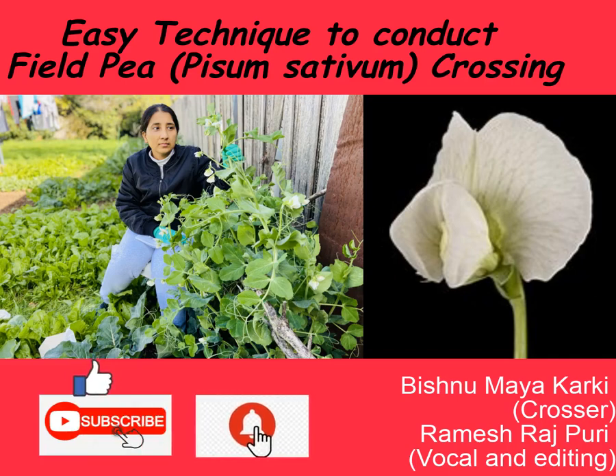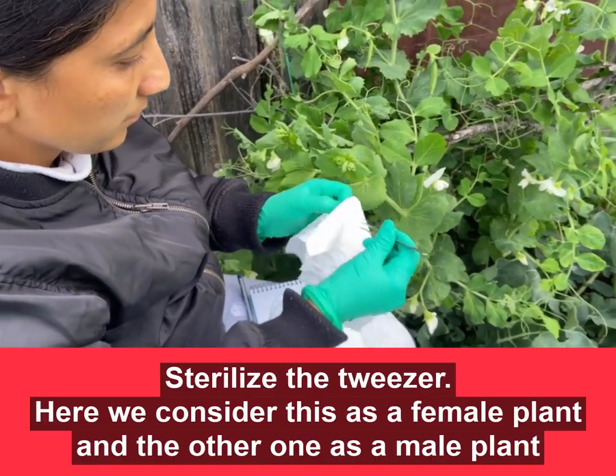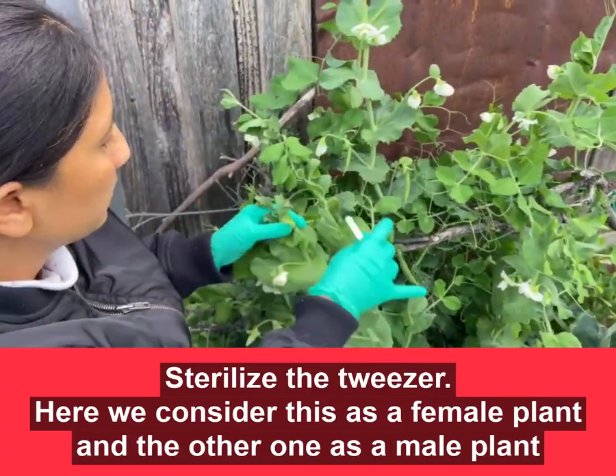Hello friends, today we are going to present you with a simple technique to do field pea crossing. These are the materials required for the crossing. First of all, sterilized tweezers with ethanol. Here we consider this as a female plant.